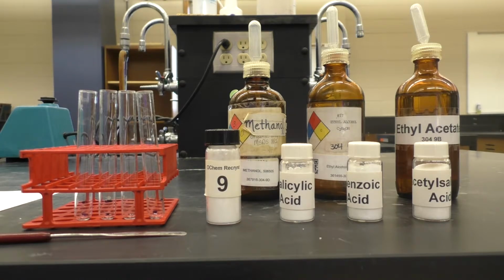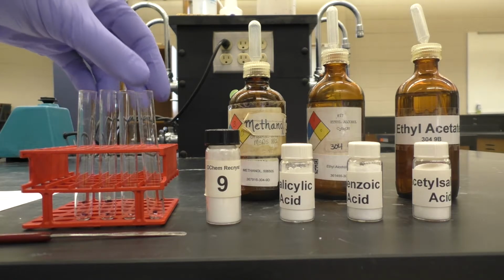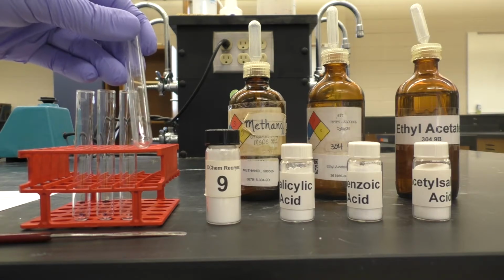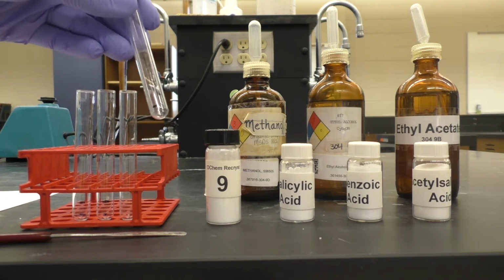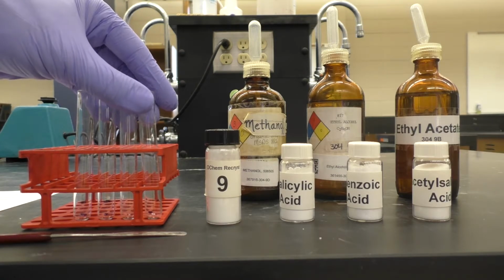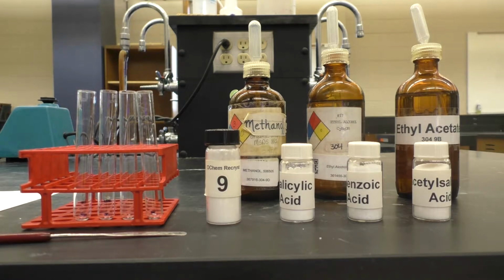And the way to measure the appropriate solubility is to take a small test tube, measure out a certain amount of compound, and then add a certain amount of solvent to it and shake it up and see what the solubility characteristics are like. Now, if the compound is soluble at room temperature, then that solvent will not be good for recrystallization.